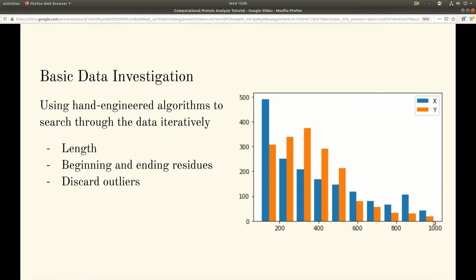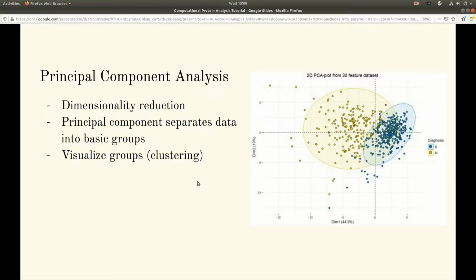So let's say we had a very tiny amount that were way out at 5,000, we would want to get rid of those. And we'll talk more about that later. Okay, so principal component analysis is a really easy tool that a lot of people do first, and it can actually give you insight into your data and be a predictive mechanism if you do it correctly. And if your data is more complex, then it needs to be evaluated by more computational analysis.